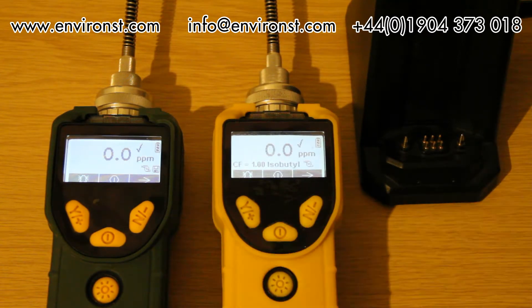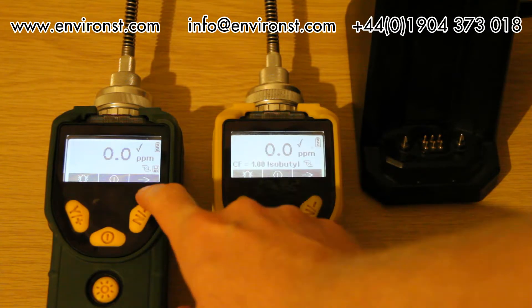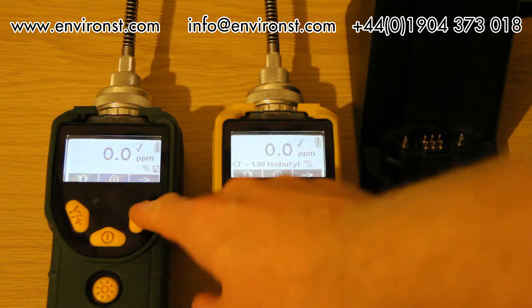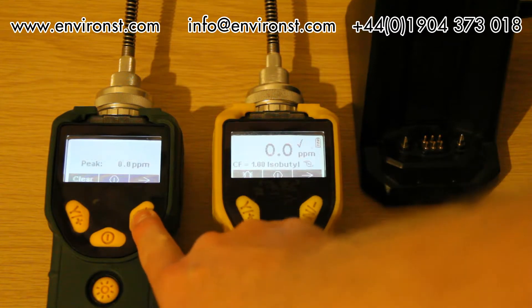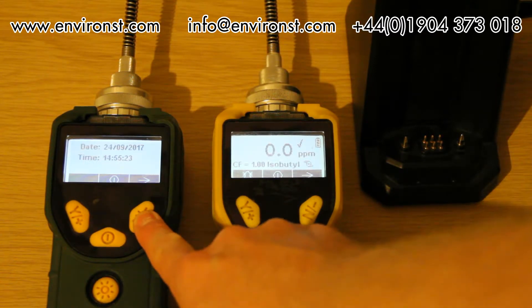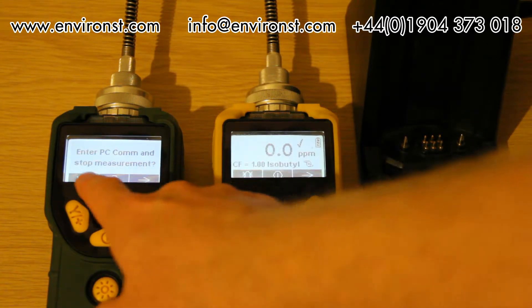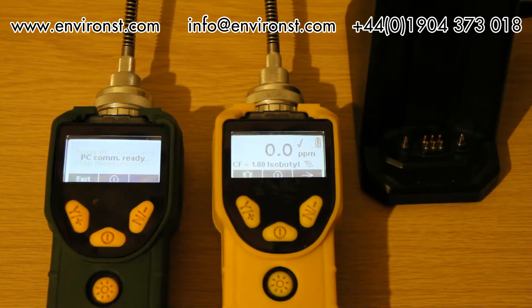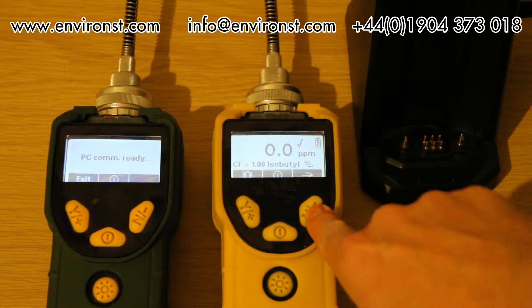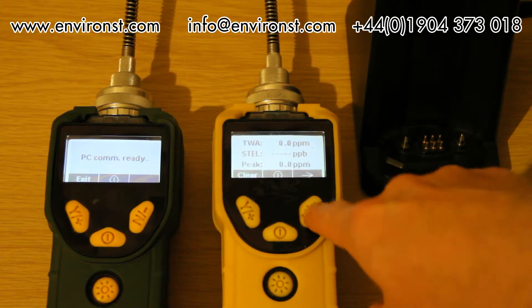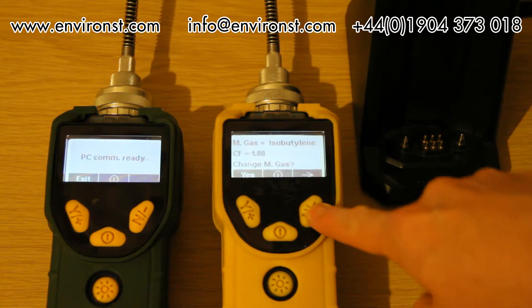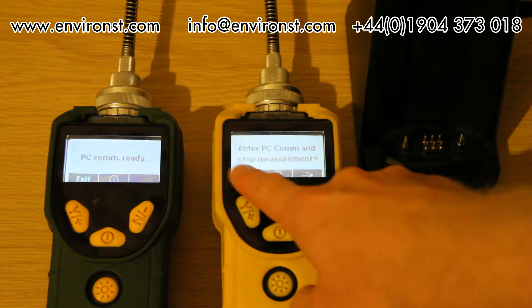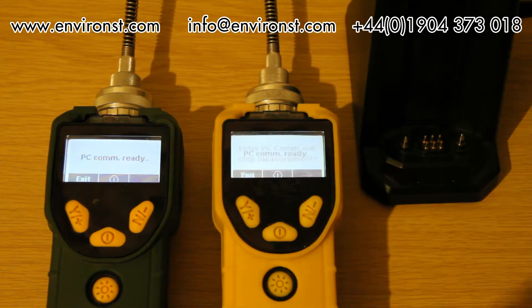For both instruments it's exactly the same procedure. We've got a cross arrow here, we select the button underneath it, we scroll through and it says enter PC communications and stop measurement. We say yes. That's now ready to be hooked up to a PC. Same here if we scroll across, enter PC communications and stop measurement, yes.